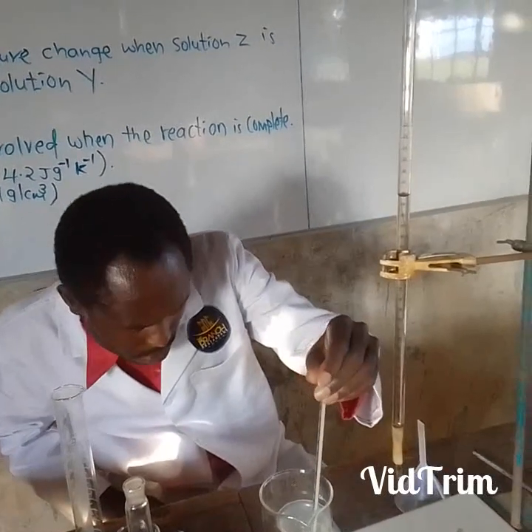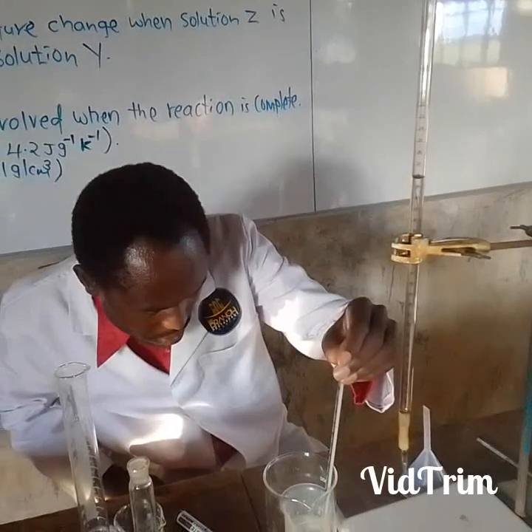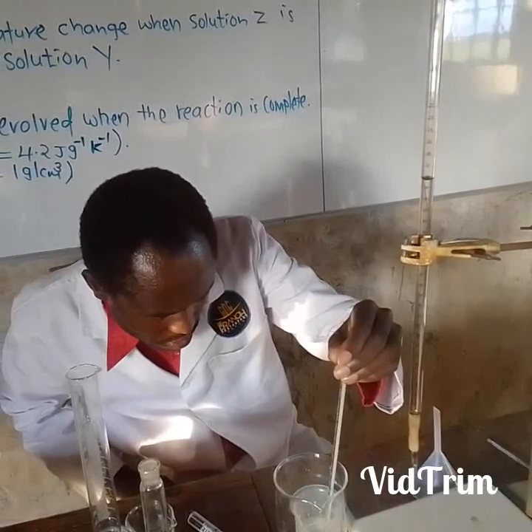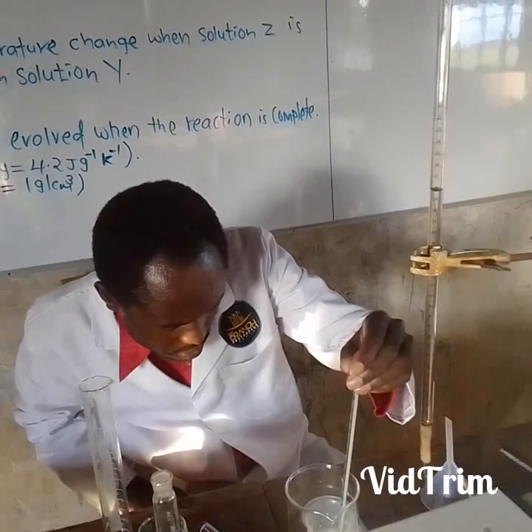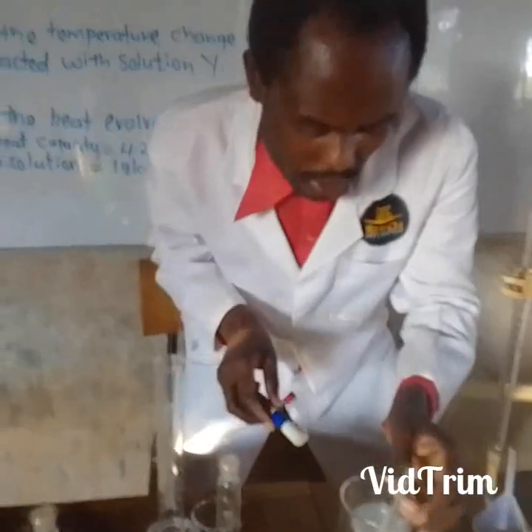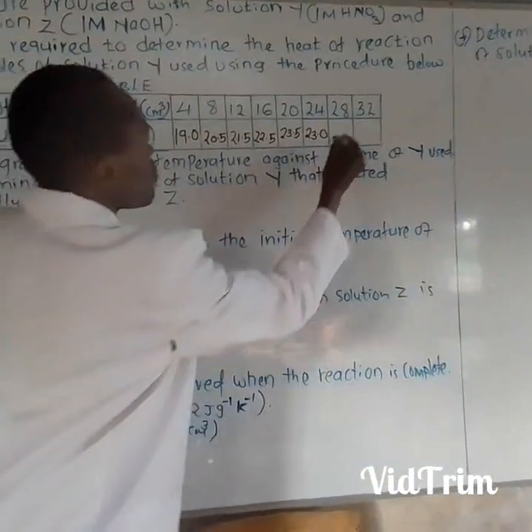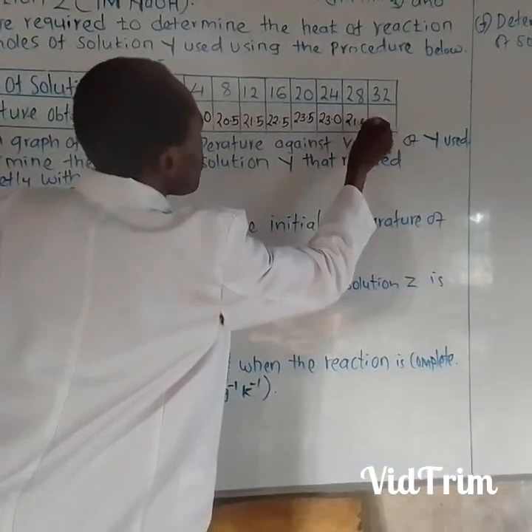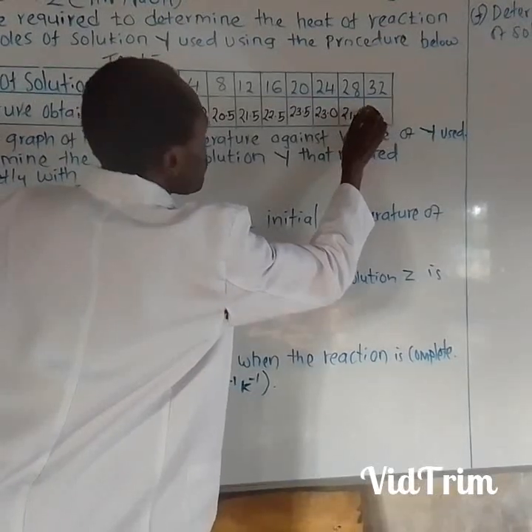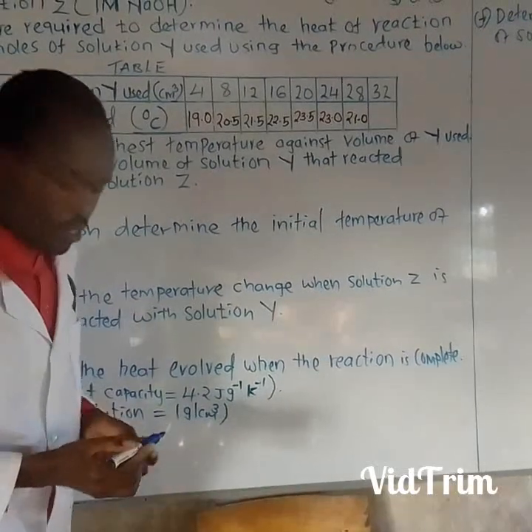It has stopped at 21. It has dropped to 21. So I have to record 21.0.